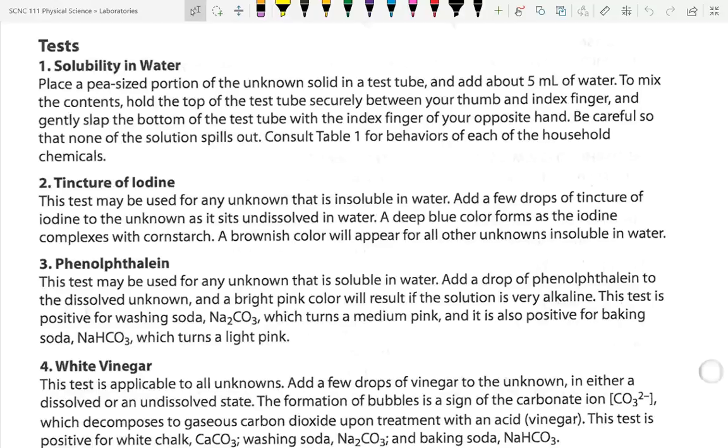And then you want to do this for about a minute. A minute of mixing. This is what the chemist told me is the best solution. The textbook, or the guide, says to go like this, but he said his experience is that going like this works better. But we want to do it for about a minute, right? Not just, oh, I've done it for 10 seconds. Do I see anything happening there?